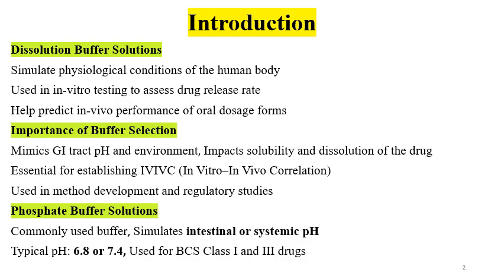The critical excipients, pH dependent polymers or pH independent polymers also get dissolved or swelled, or the excipients also get released from the formulation in the dissolution media.